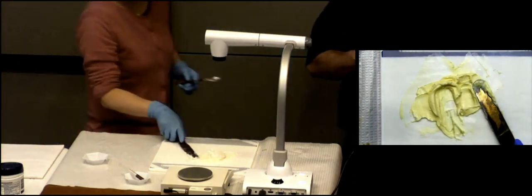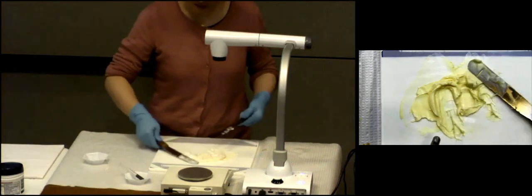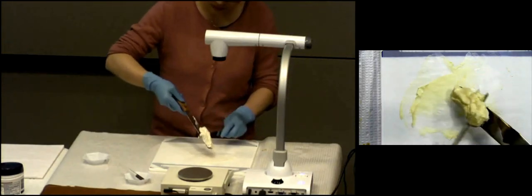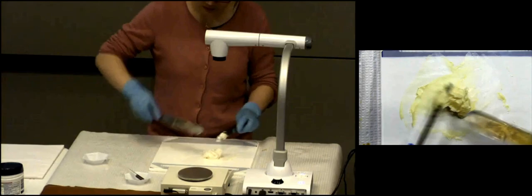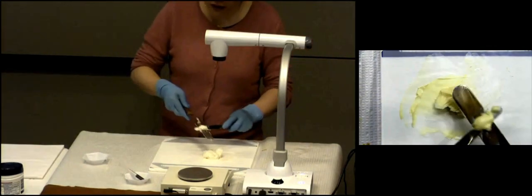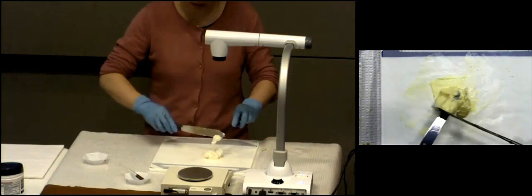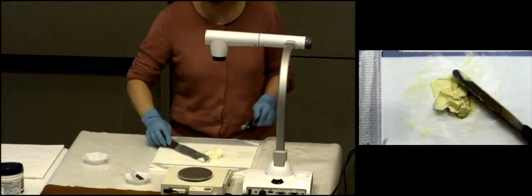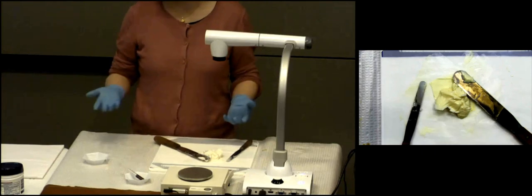And especially when you're mixing two different creams today with your wet lab, they're not the same consistency. You need to squish them together and put some force to basically break them apart. So as you're doing that, you've got to be looking for and trying to break up any inconsistency, so it's all nice and homogeneous. Although be very careful, because you don't want to break your parchment paper. You don't want to have a little hole in your parchment paper. So this is important. You need to apply a certain amount of force, but do not break your paper.